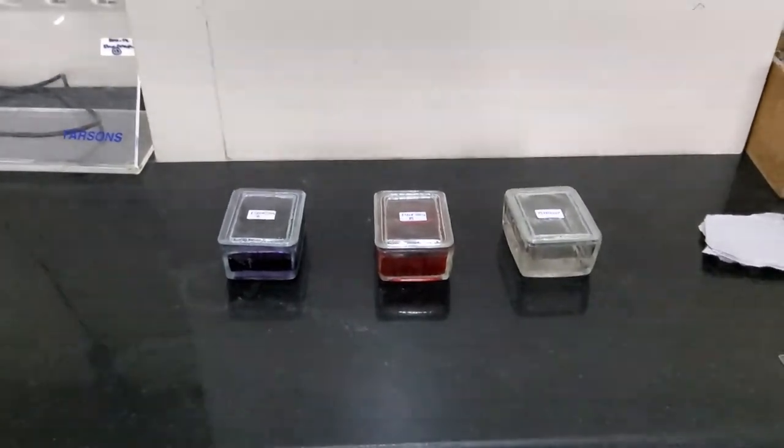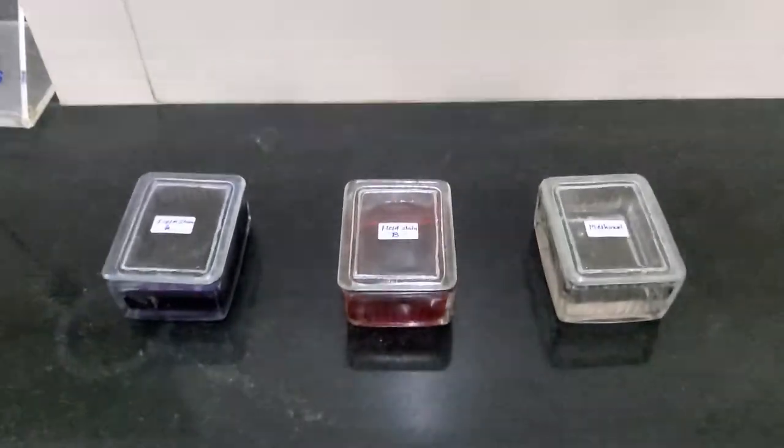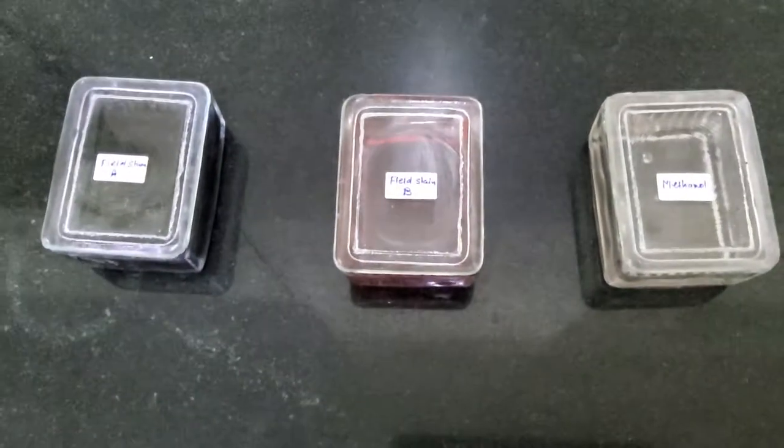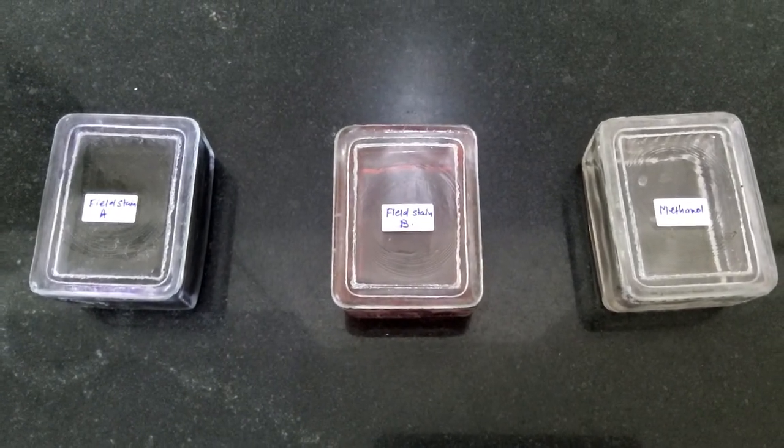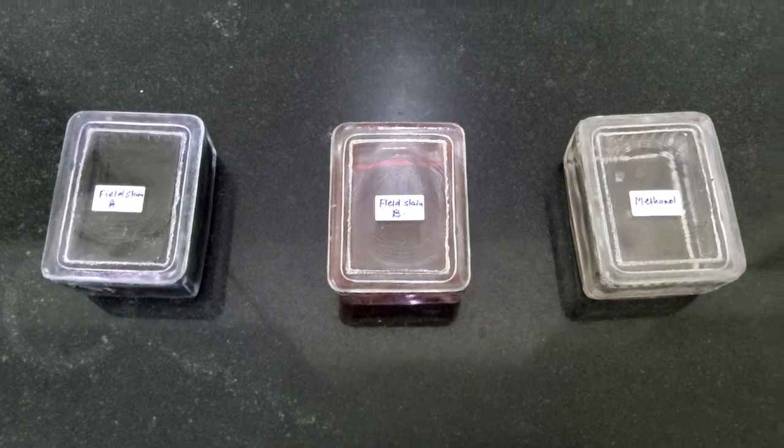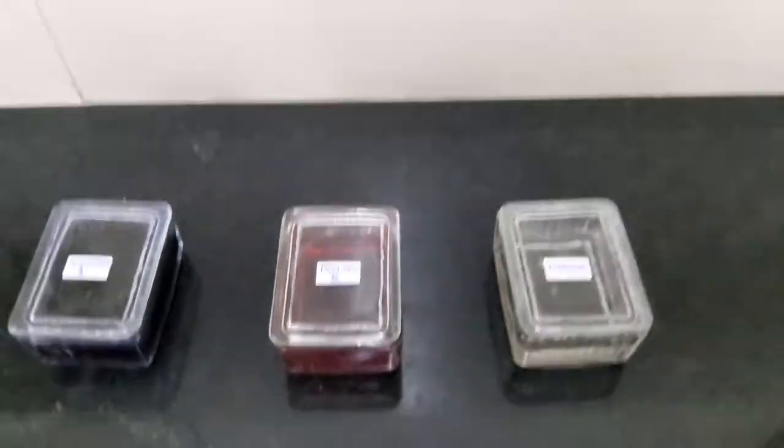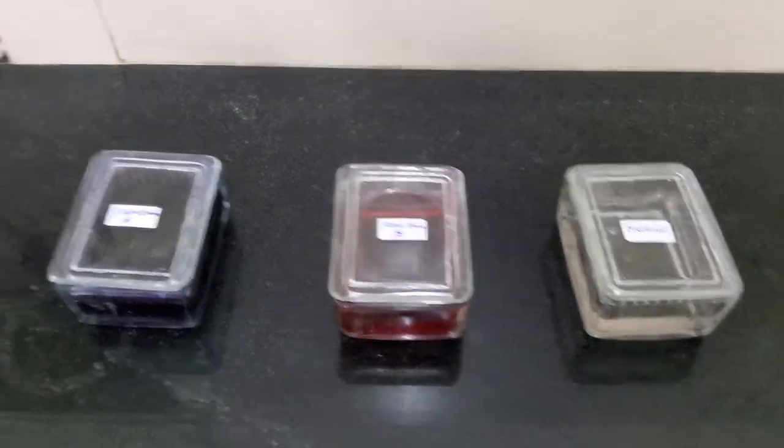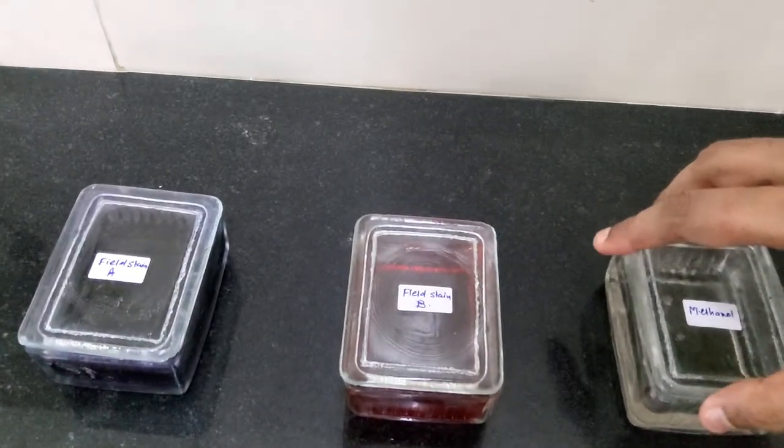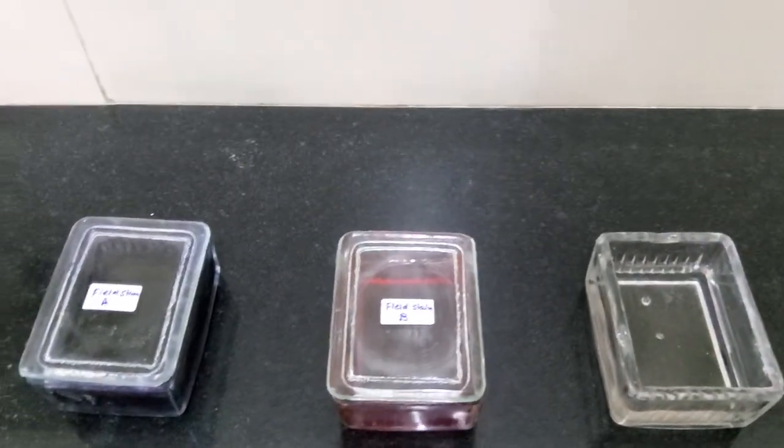All requirements have been kept ready in the staining jars. You can see that it's all kept labeled properly. One staining jar has methanol, another has Field stain B, and then Field stain A. I will start with methanol first because I want to fix my film. I'm going to quickly open the methanol jar.